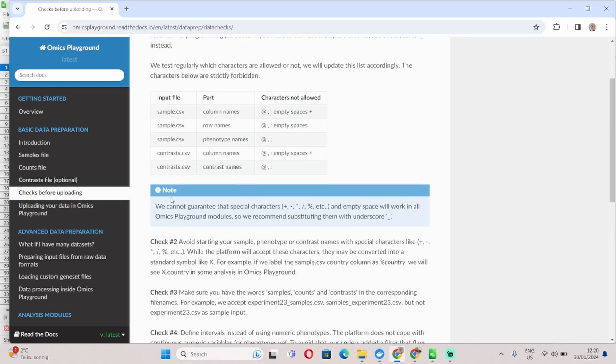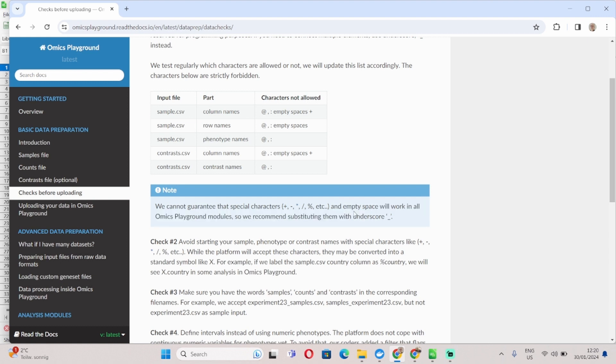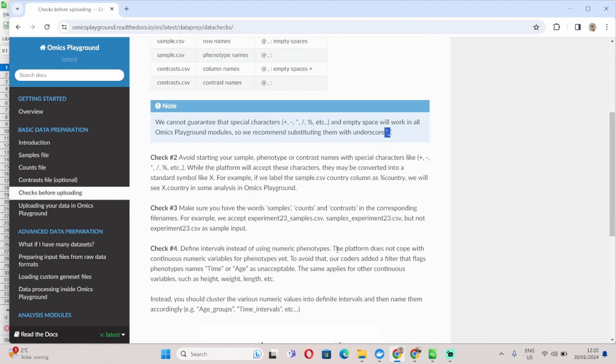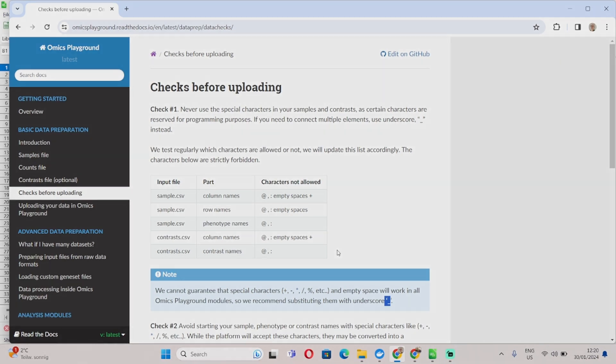And as you can see in the note here, we cannot always guarantee that special characters will work. As such, please avoid using them, also avoid using empty spaces, and instead use underscores to connect different components of your naming. I invite you to check this page if you have more questions. Otherwise, you can always get in touch with our support staff.